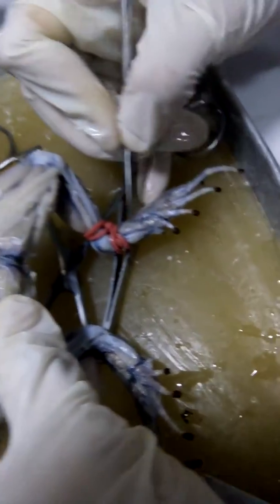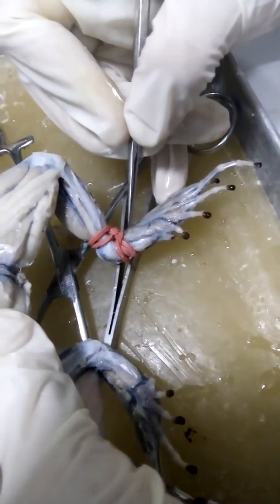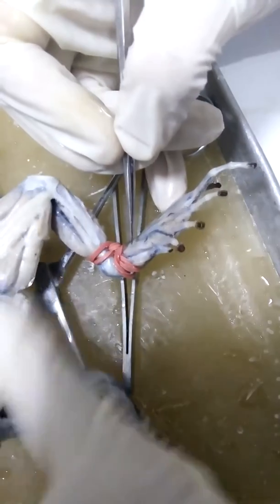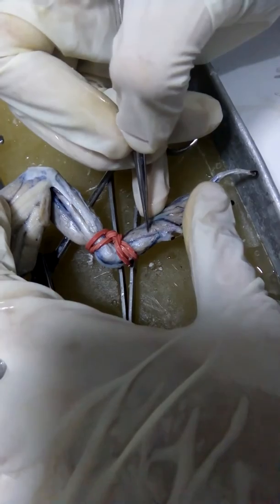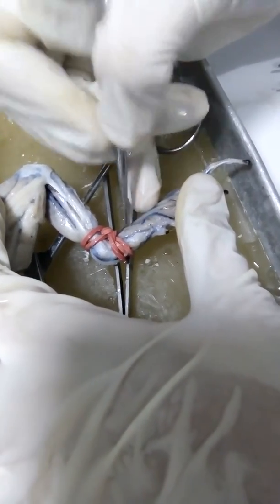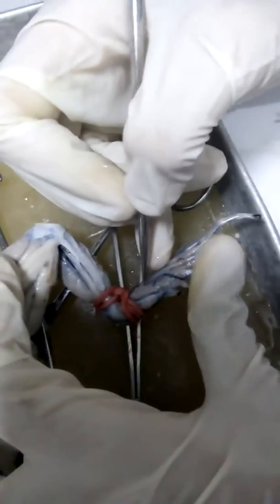And then we can also see here your flexor tarsi anticus. So flexor tarsi anticus.